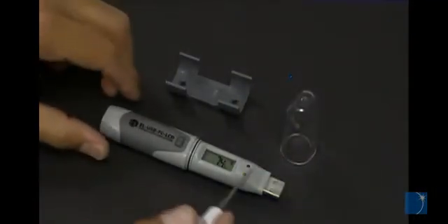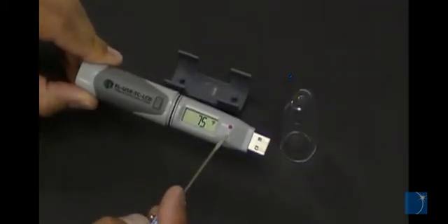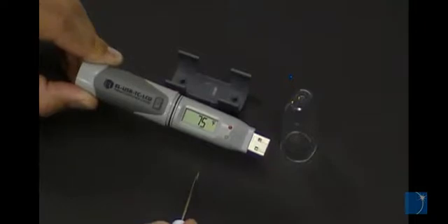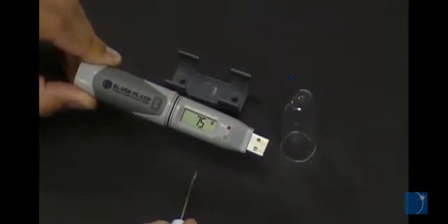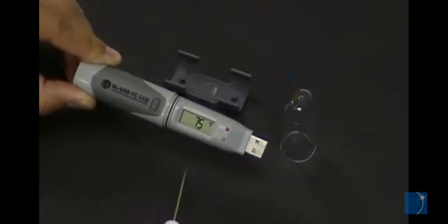ELUSB loggers use LEDs to indicate when data is being recorded or when an alarm level has been breached. Some ELUSB loggers include a LCD display while others do not.